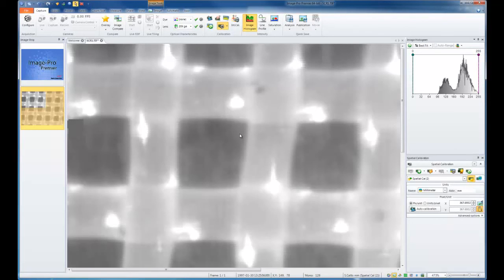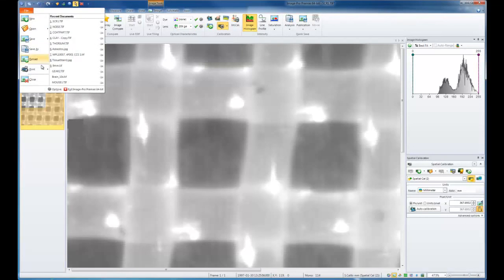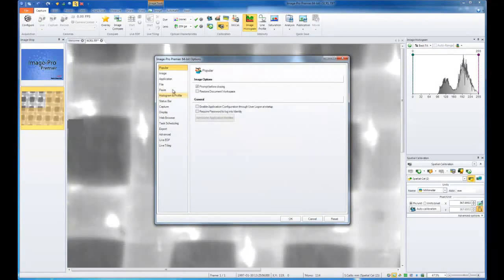While using any tools in Image Pro Premiere, if I ever need to find out more information about the tool I'm using, it's important to understand that all tools come with super tooltips. And if the super tooltip does not say enough about the tool, find the gear. Gear means options. If you can't find the options next to the specific tool, be sure to go to the File tab and choose the main system options, which has many different options available for the software.